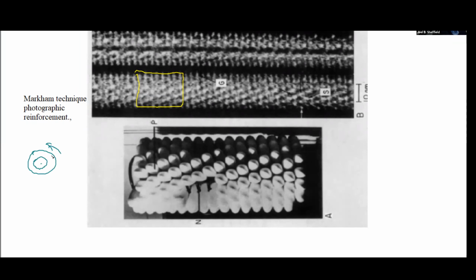And you may be aware, when you watch a car go by that has good bright wheel hubs, suddenly you see the wheel hubs line up because it's a matter of how fast they're going compared to the periodicity of the light you're looking at it with. You could actually see the repeat pattern in samples this way, photographically. I'm saying this because I used to do it. It's a very interesting exercise. And at that point it required no computer processing at all.